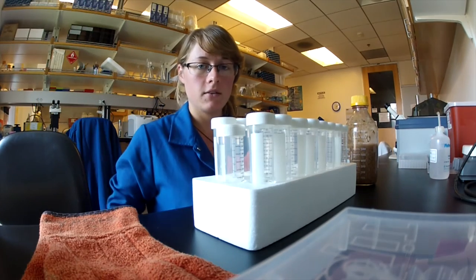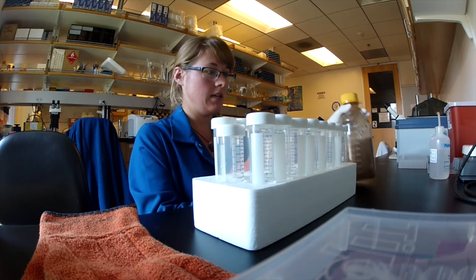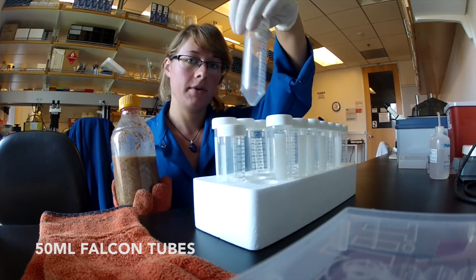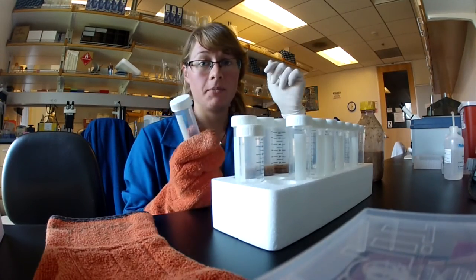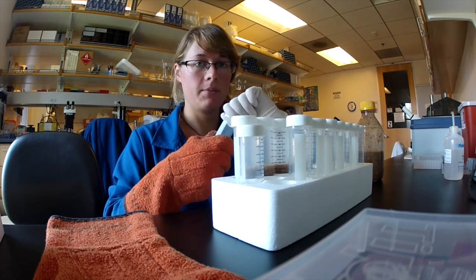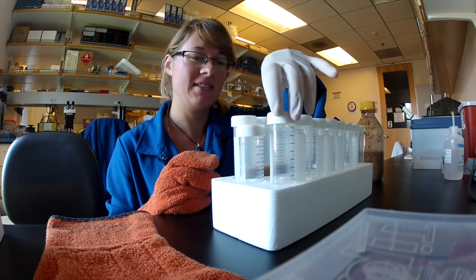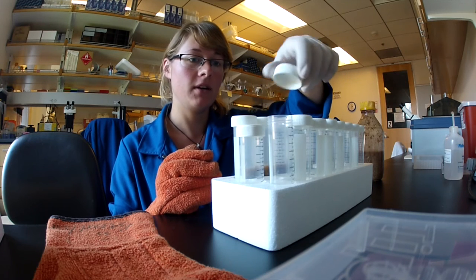After the diet comes out of the autoclave, we shake it up, make sure it's well mixed, and then pour it into 50 mL plastic falcon tubes. We fill them up about halfway so that the beetles can bore in. Before pouring, I like to loosen the caps to make it a faster, more efficient process. It's also important to try to be as sterile as possible — uncap, pour, and cap quickly so that there's less chance of contamination in your tubes.